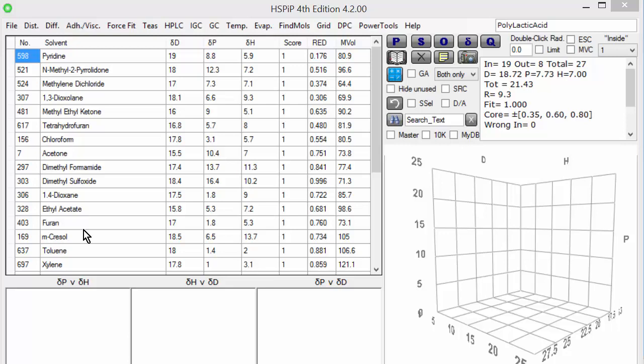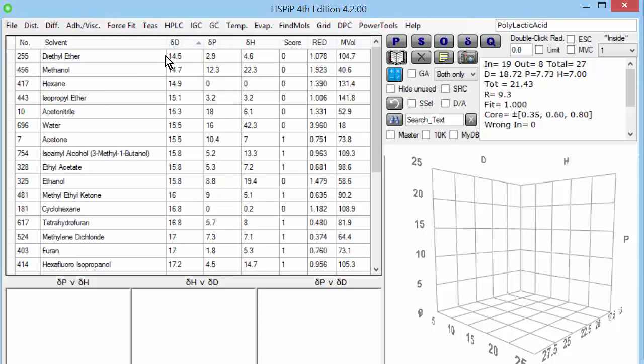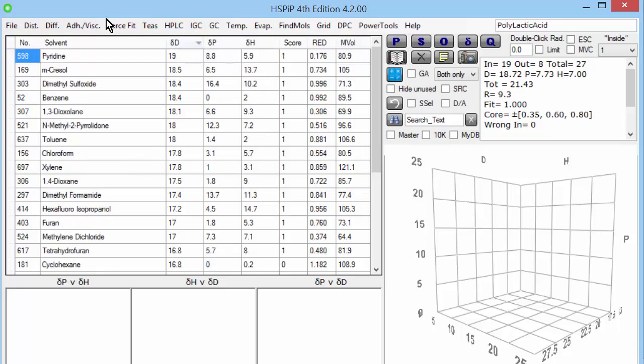I have here a selection of solvents. The reason we have them will be explained in a later video. They each have the three values of DD, DP, DH. If I click on any column in HSPIP it sorts it and now we see that diethyl ether has 14.5 DD. Methanol has got a bit more. And if I click again we have pyridine has a large amount of DD. Cresol has got less and so forth.